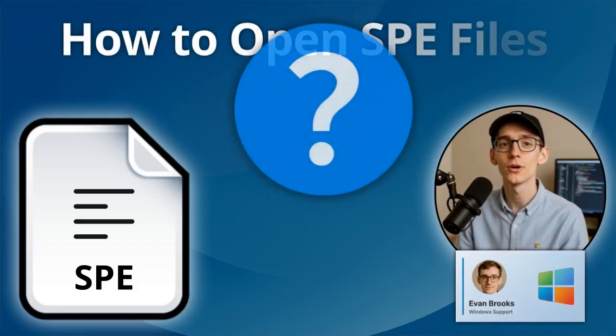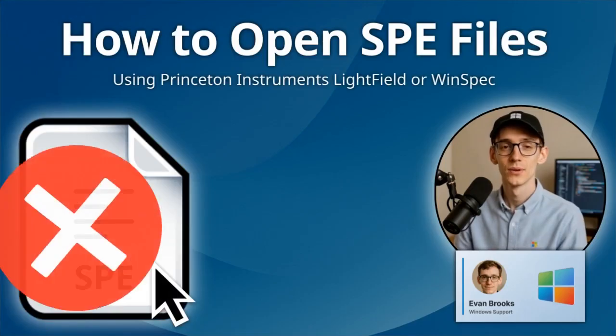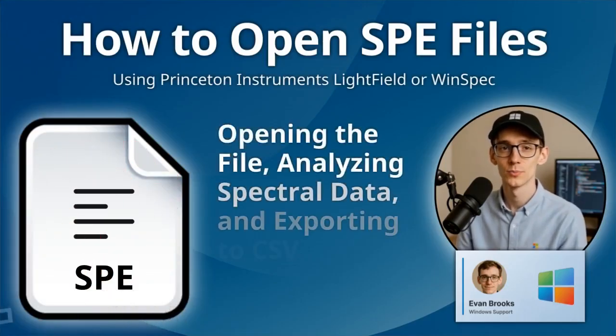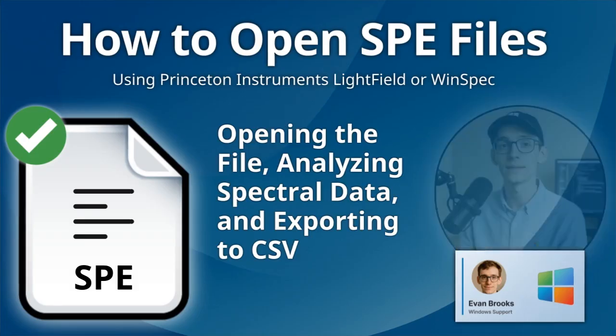A WinSpec spectroscopy data file contains scientific spectral measurements, light intensity data captured by Princeton Instruments detectors for research analysis. I'm Evan Brooks, Certified Support Engineer, and I'll help you open, analyze, or convert these spectroscopy data files.